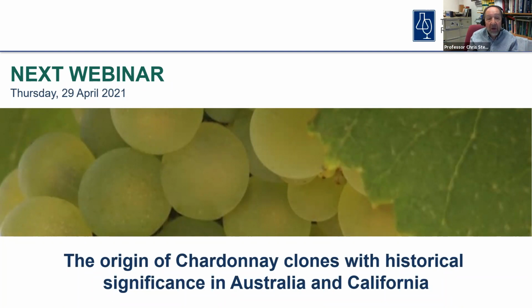So for me, I'd be uncomfortable using laccase as an indicator of botrytis. As an indicator of potential wine spoilage, if you've got a must where there's laccase, when you make your wine, it is going to go brown. All right, thank you.